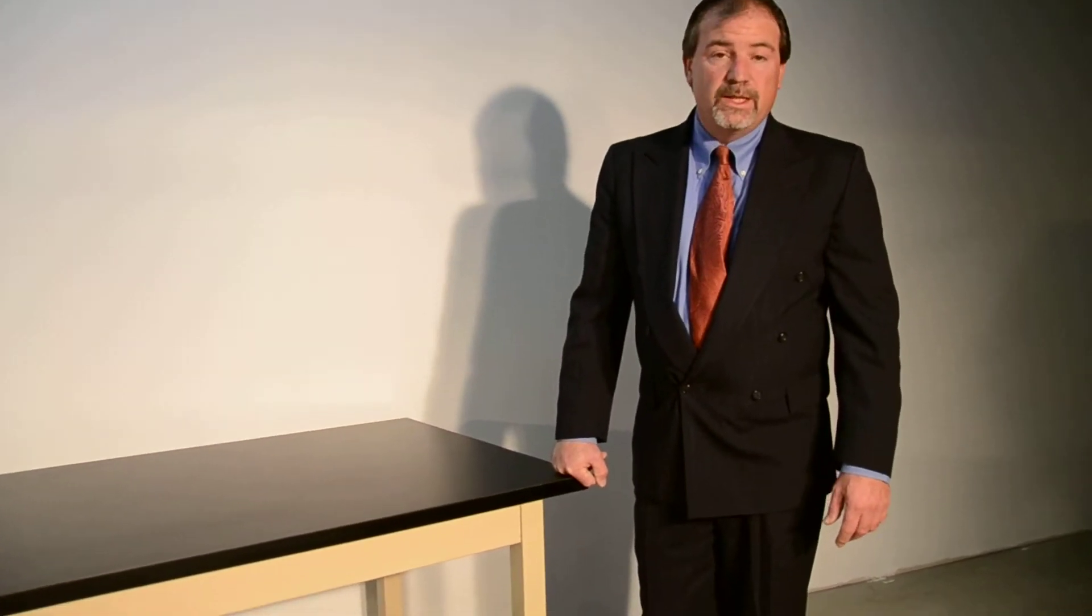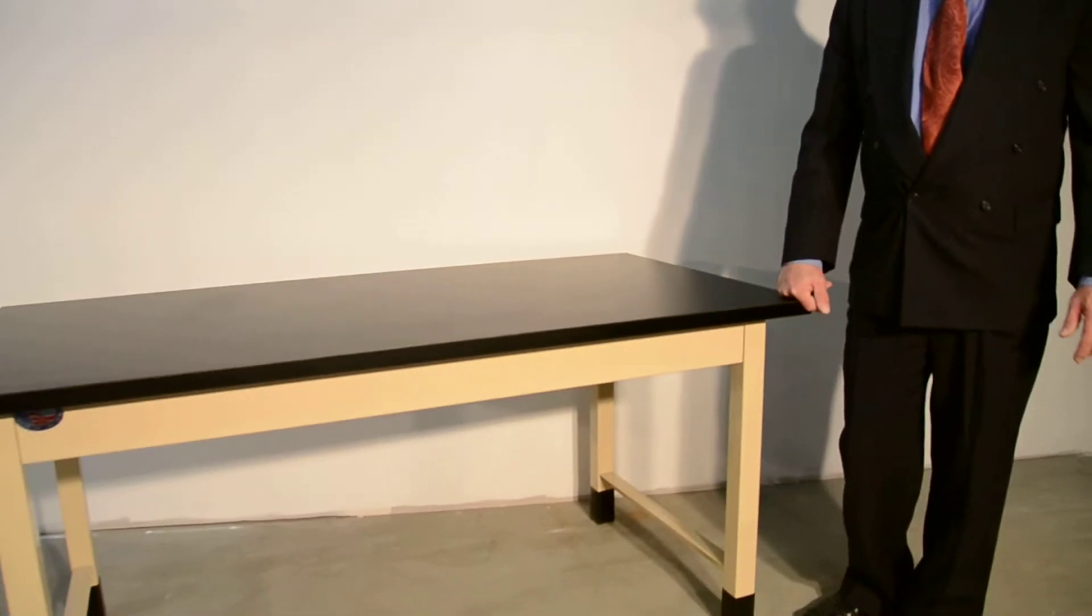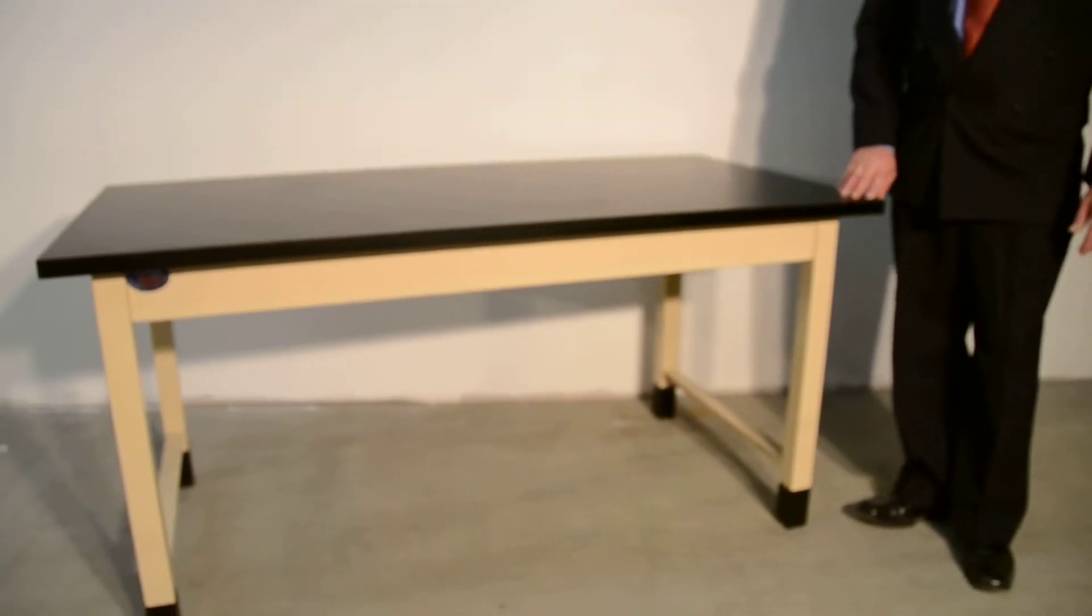Today I'm going to be talking about our model HDL. HDL stands for our Heavy Duty Lab Workbench.